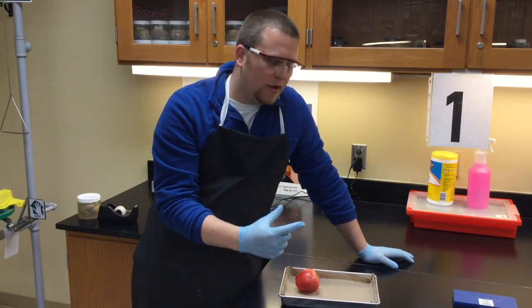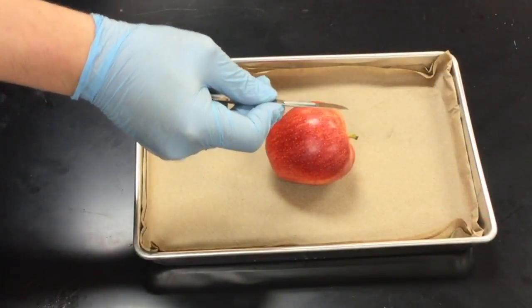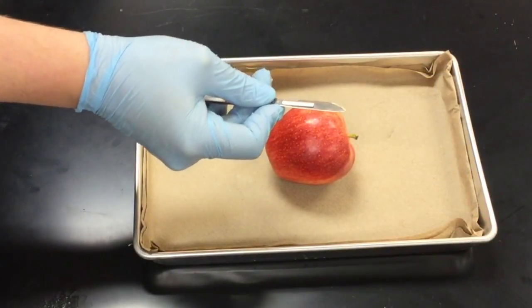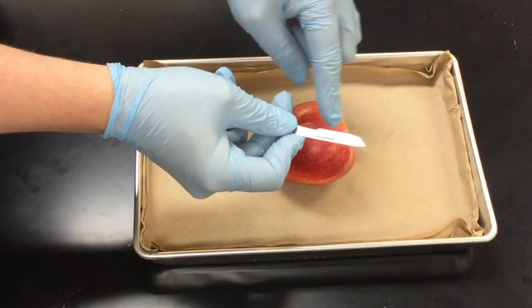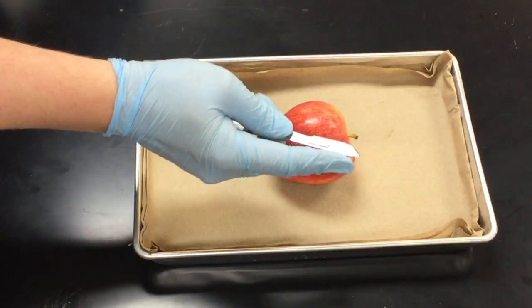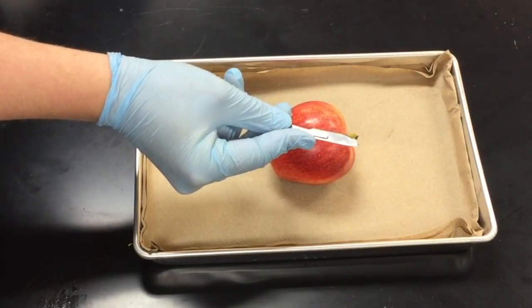I'm going to demonstrate now how to go ahead and properly hold the scalpel. Now, there is a right and wrong way to hold your scalpel. With this particular device, the rounded edge here is going to be the sharp side, or the blade, and what we have up here, which is the flatter or smoother side, is going to be the dull end.